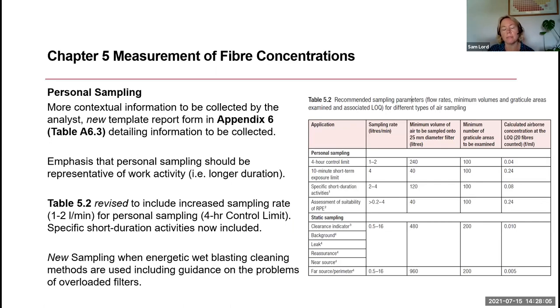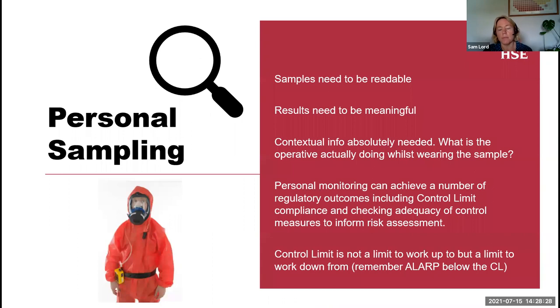And particularly because they're associated with overloading the filters with the dust that's created from the blasting process itself, but also the fact that it's quite a damp atmosphere. So there's some guidance to help analysts work out strategies to try and overcome those issues. So yeah, I said I'd go back into personal sampling and look a little bit in more detail.